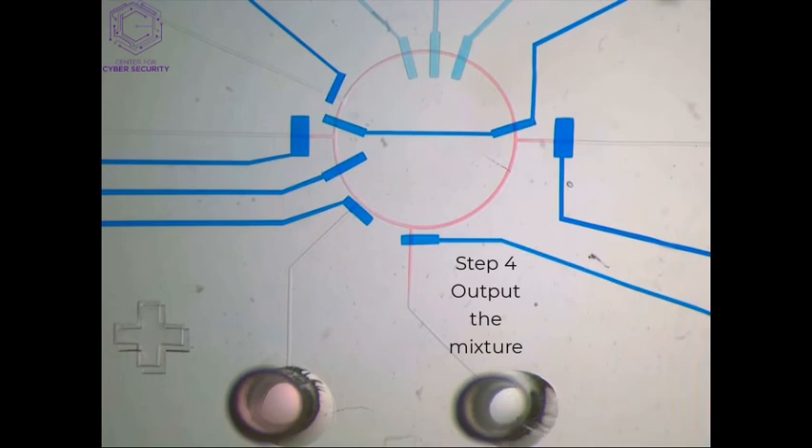After mixing, the resultant mixture is transported to the output reservoir.